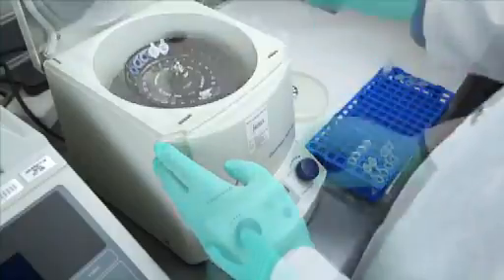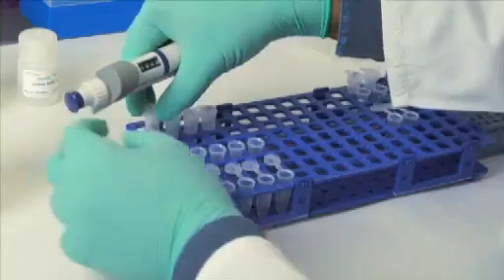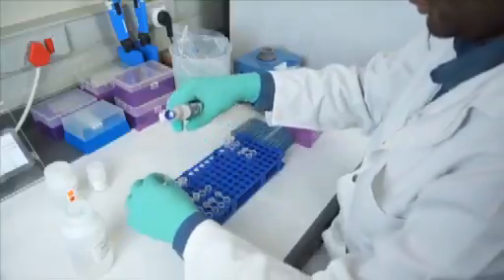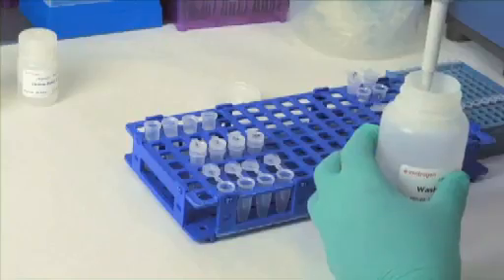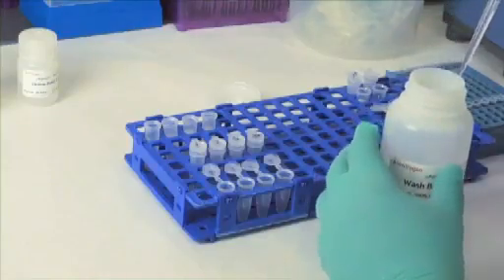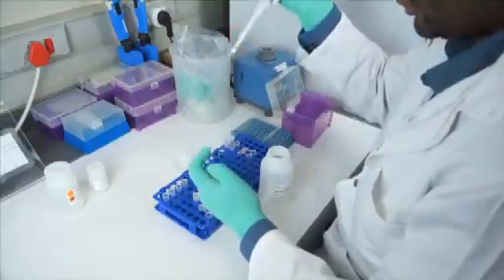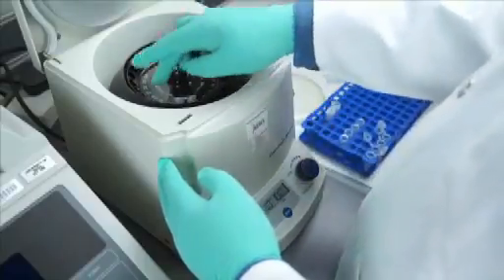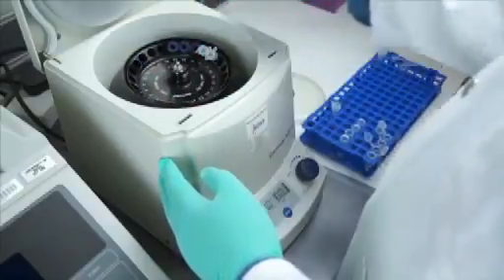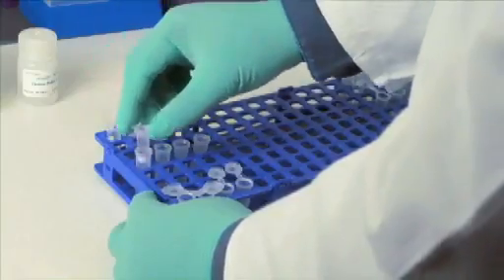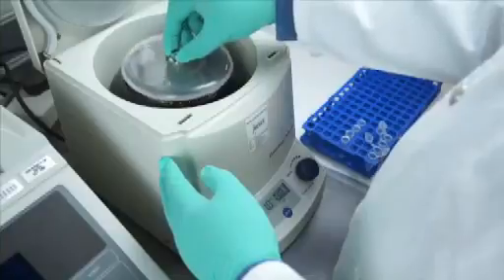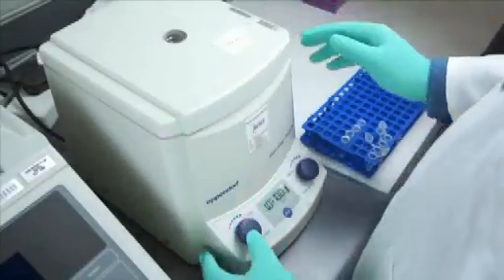Centrifuge the column at 10,000 RCF for 1 minute. Transfer the column into a new collection tube. Wash the column with 650 microliters of wash buffer. Centrifuge the column at 10,000 RCF for 1 minute. Transfer the column into a new collection tube. Centrifuge the column at maximum speed for 2 to 3 minutes.